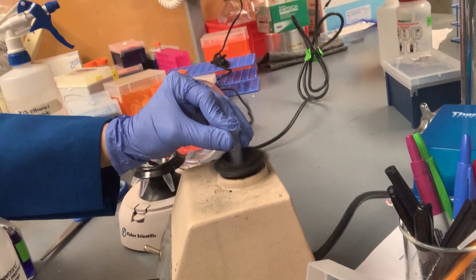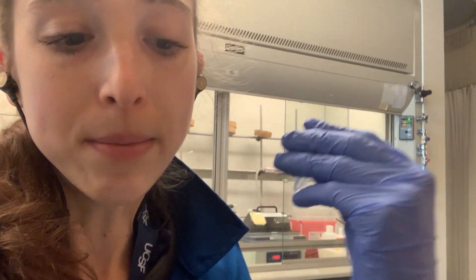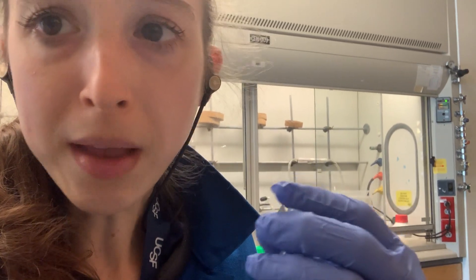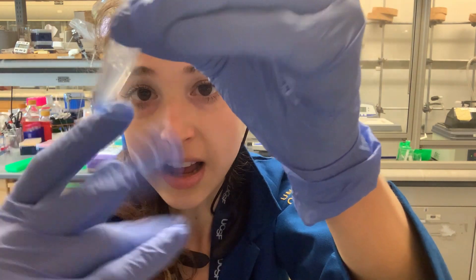Another option is a vortex mixer — we sometimes call it a finger vortex when we do it with our finger. You can see that it's going to mix everything really well; it makes this vortex. But this can be bad if your samples are really sensitive, maybe they have enzymes in them and you don't want to deactivate them, so you want to do something more gentle. The finger flick is a great way to do this.